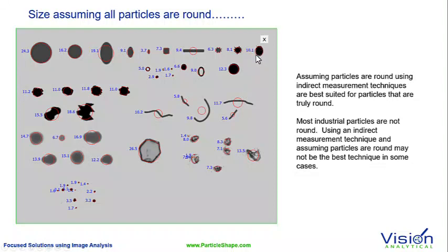If you look at just the data, 10, 11, 10, it may be misleading, because these size-only measurement techniques would not be able to tell you the difference if there was a 10 micron particle and it was this, or if it was this. So as a result, there are different measurements made using dynamic image analysis that benefit fibers.